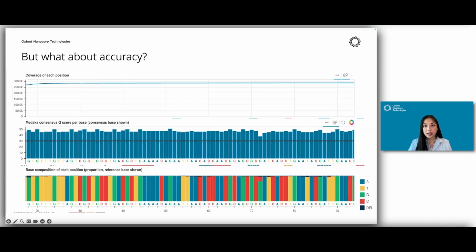However, when we actually capture the consensus and look at your stacked reads up against the alignment that you're looking for, we actually are able to increase that Q score quite a bit. So what you'll note here is a Q score of Q50, which should give you all of the confidence that you need to call bases with this high level of accuracy. So we're happy to walk you through this in further depth if you have further questions.